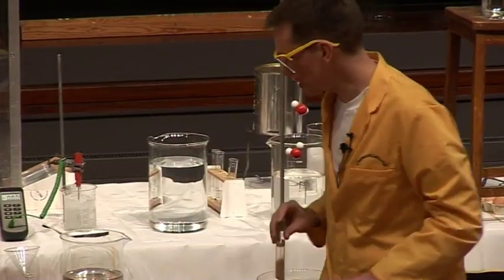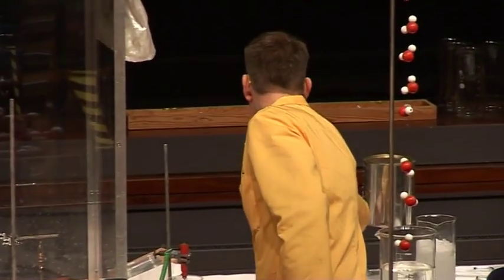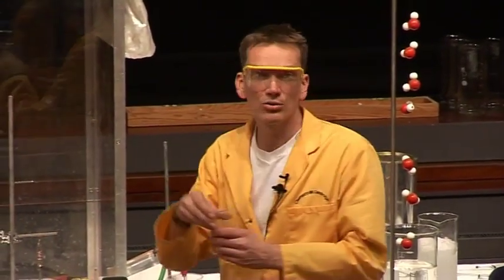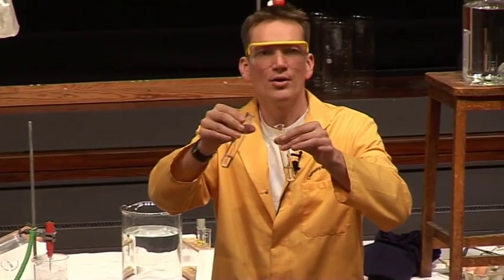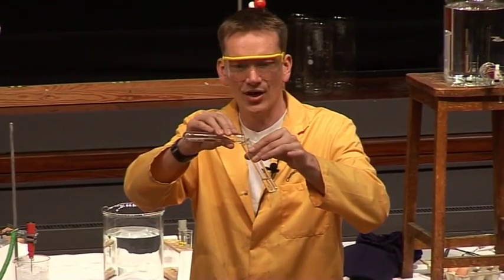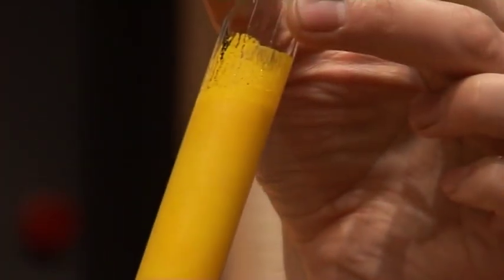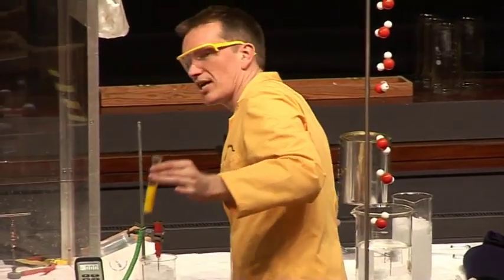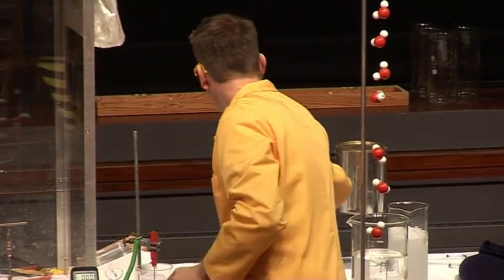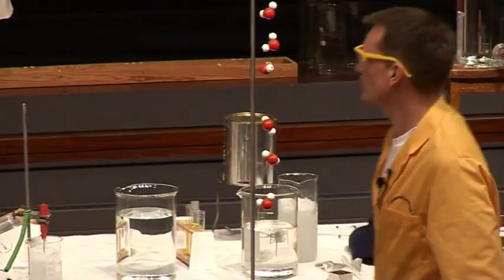It's very unusual to see a reaction between two solids. I also have the same compounds here, now dissolved in water. Okay? And mixing these two, the potassium iodide and lead nitrate, instantly form a bright yellow precipitate of the lead iodide that you saw. But the reaction takes place much more quickly in solution when the substances are dissolved, since they can intimately interact with each other.